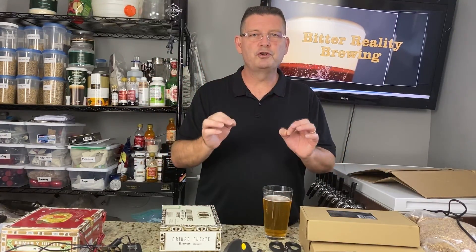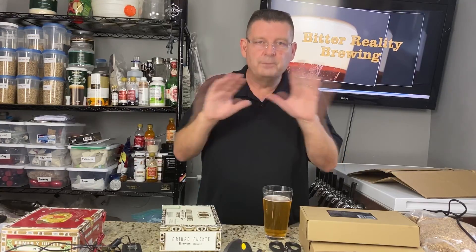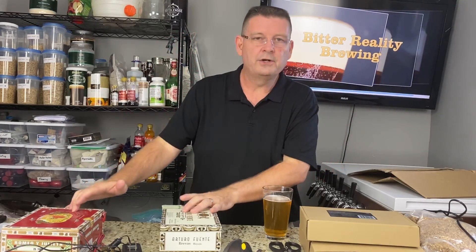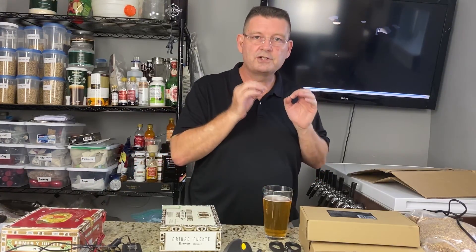Welcome to Bitter Reality Brewing. Today we're gonna make super, super easy stir plates — like the easiest stir plate you've ever made. I mean stupid simple. We're gonna show you stir plates that are free or close to free, and then ones that are extremely inexpensive — a little over $10 per plate, $20 for a pair.